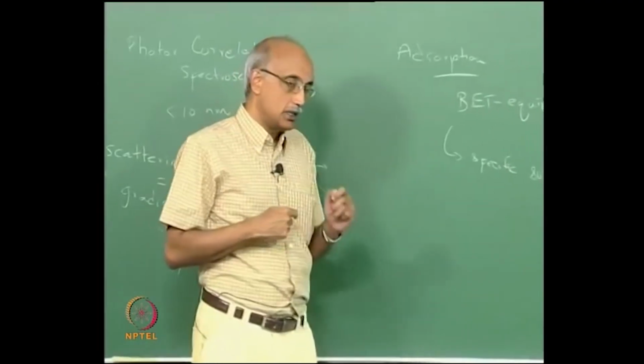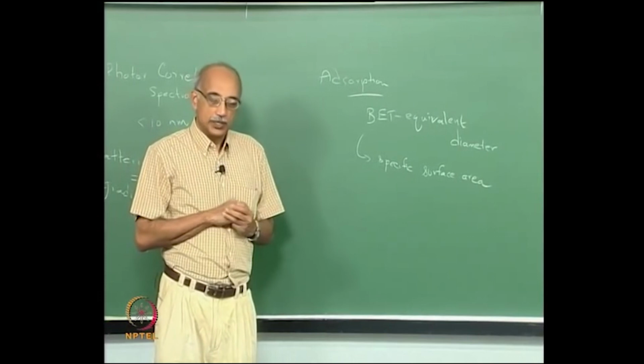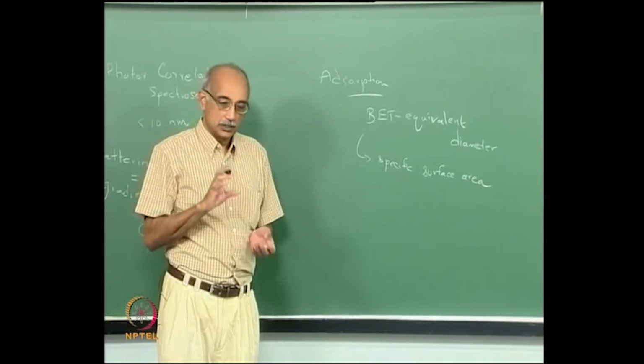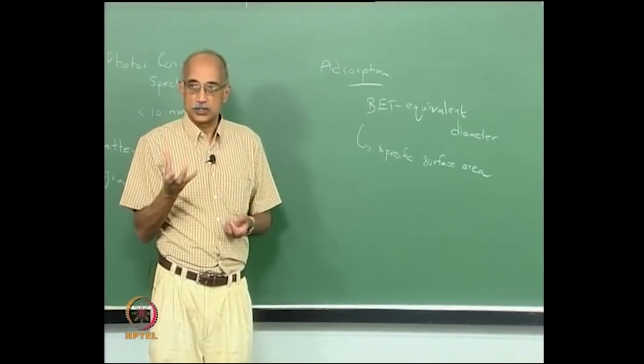So, the BET technique can once again indirectly predict or characterize the nature of the surface region as well as the subsurface region.